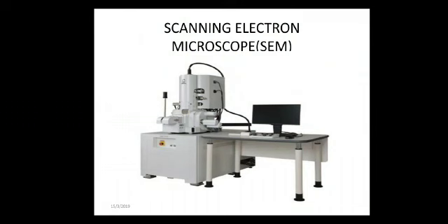The electrons interact with atoms in the sample, producing various signals that contain information about the sample surface, topography, and composition. The principle of operation of the scanning electron microscope is that an electron beam is focused onto the sample surface, kept in a vacuum, by electromagnetic lenses. The beam is scanned over the surface of the sample.